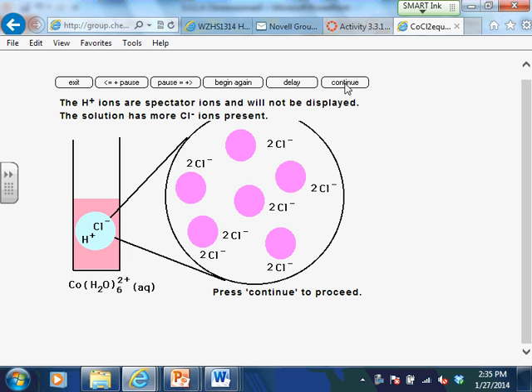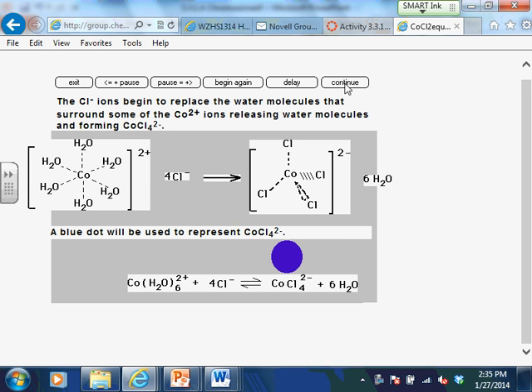All right, so you add the chloride ions into it. And it turns out this will form a separate complex with cobalt, okay? So the complex that can form here is cobalt with 4 chloride ions, to form CoCl4 2 minus, okay? And that is actually blue in solution.